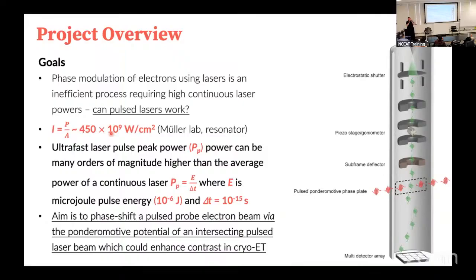But if you have a resonator with two very sort of, I think, ceramic mirrors, and you're bouncing a laser back and forth, and focusing it down to a focal point of maybe 10 or 20 micron, that's an incredibly powerful photon density. You're trying to hit a very high photon density in order to be able to affect the electron beam. So that number was our target.